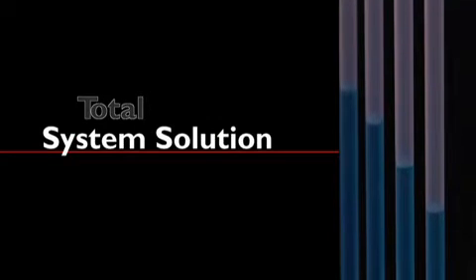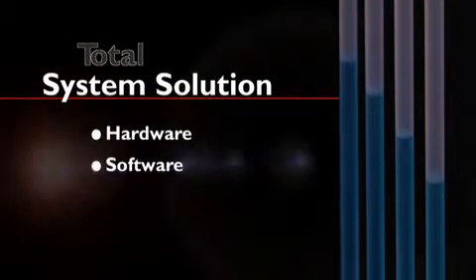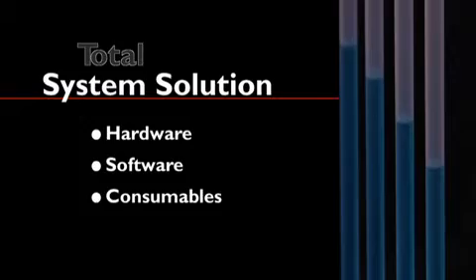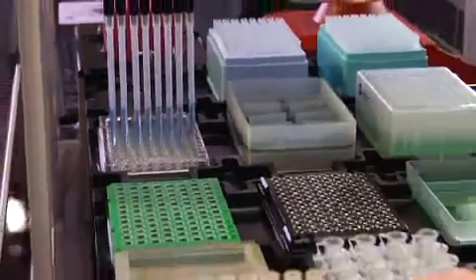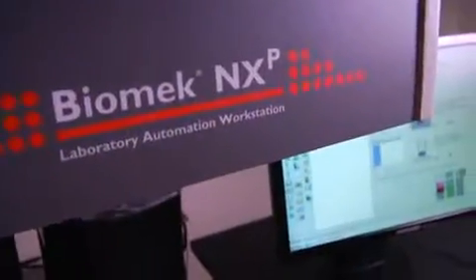Biomek tips are an important component of our total system solution for your lab. From hardware and software to consumables, we validate your entire automation system to work seamlessly and provide consistent, high-quality assay results.